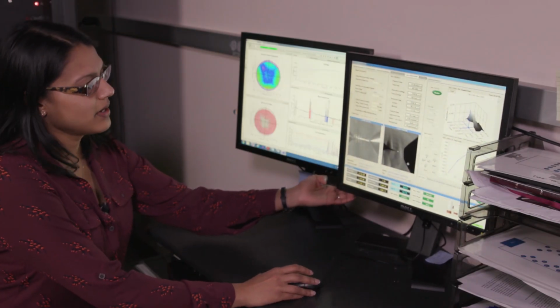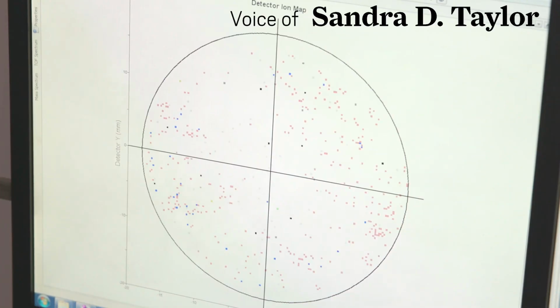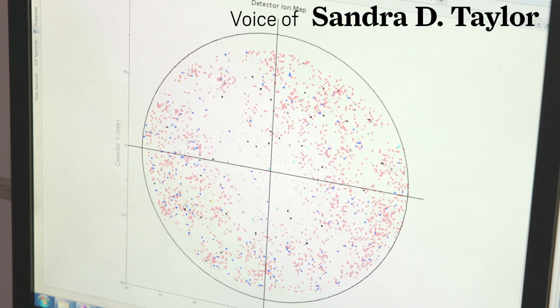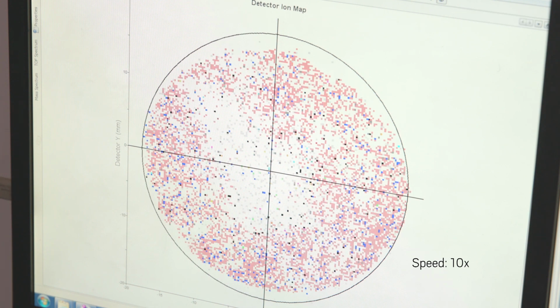And it worked. They were able to analyze the goethite-tipped microneedle in the atom probe instrument. We can see how atoms collect on the detector. We can map their coordinates in X and Y and track their location along the tip. And we can see in real time where atoms are coming off and where their coordinates are.